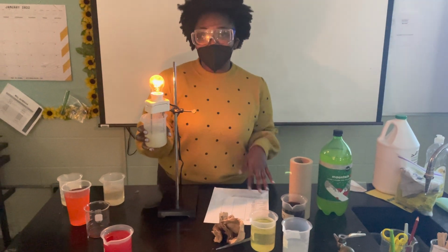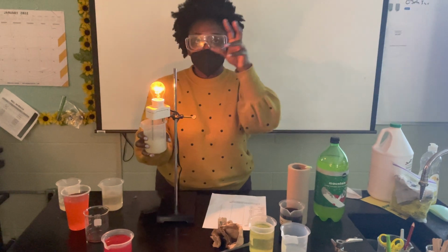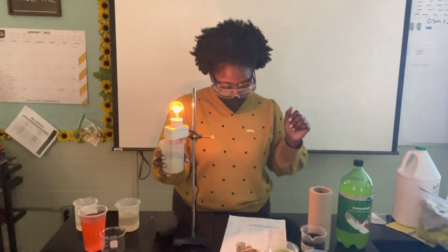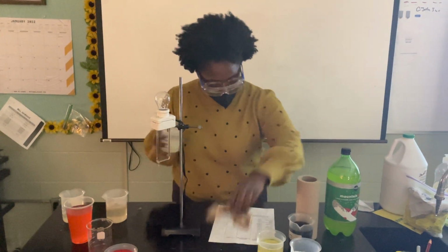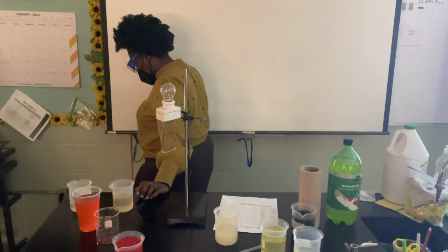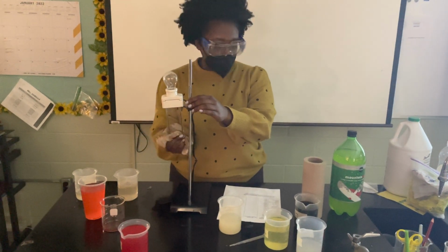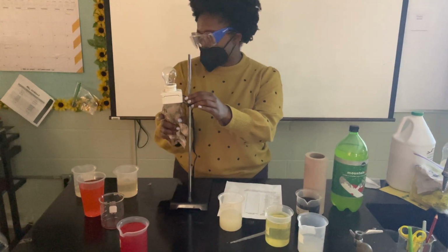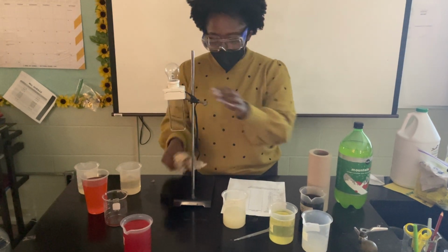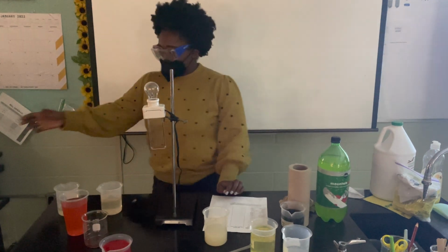It lit. I would give this a good level of electricity, of conductivity. All right, next up, shocking some people over here. Don't know about you guys. Let's clean this up a little bit. Probably need to use some deionized water to clean these probes off. It's okay for today. What's next?